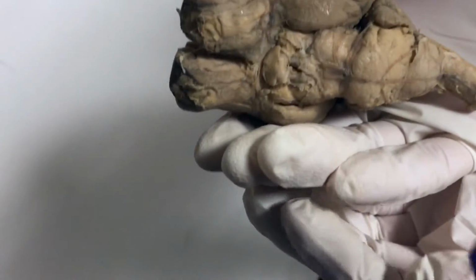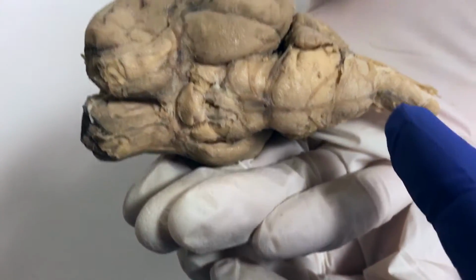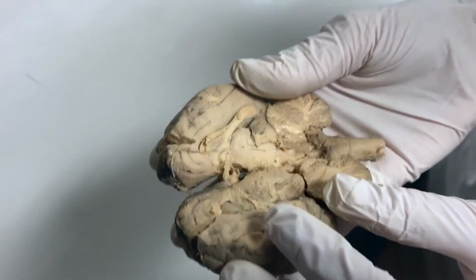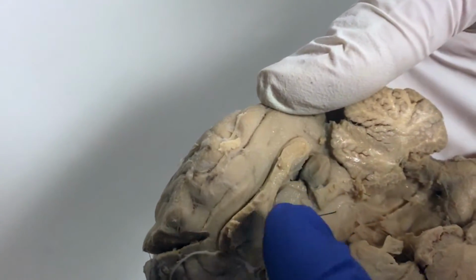So right here you can see on the bottom of the brain, you have the pons right here, which is right next to the medulla, which is responsible for controlling things like digestion and other processes. Okay. So if we cut open our brain through the magic of video editing, we can now go in and see that this little bulb right here is called the pineal body.